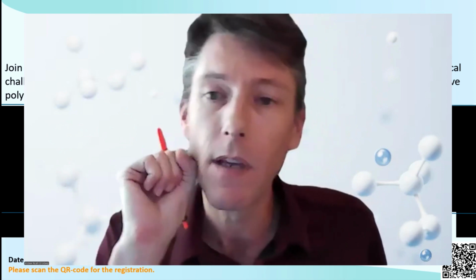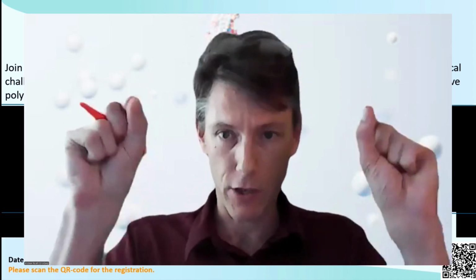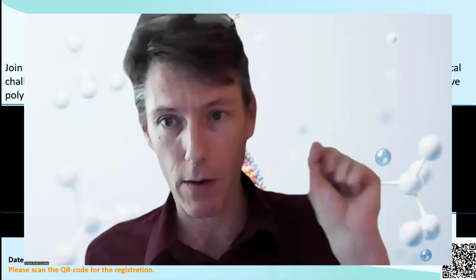And because we don't have fragmentation, we can't have that copy choice that occurs during reverse transcription by the reverse transcriptase itself. The second point is that when we click on an adapter, we can include barcodes. So we can have unique molecular identifiers. Each oligo that we click on corresponds to the single molecular cDNA that you clicked on.